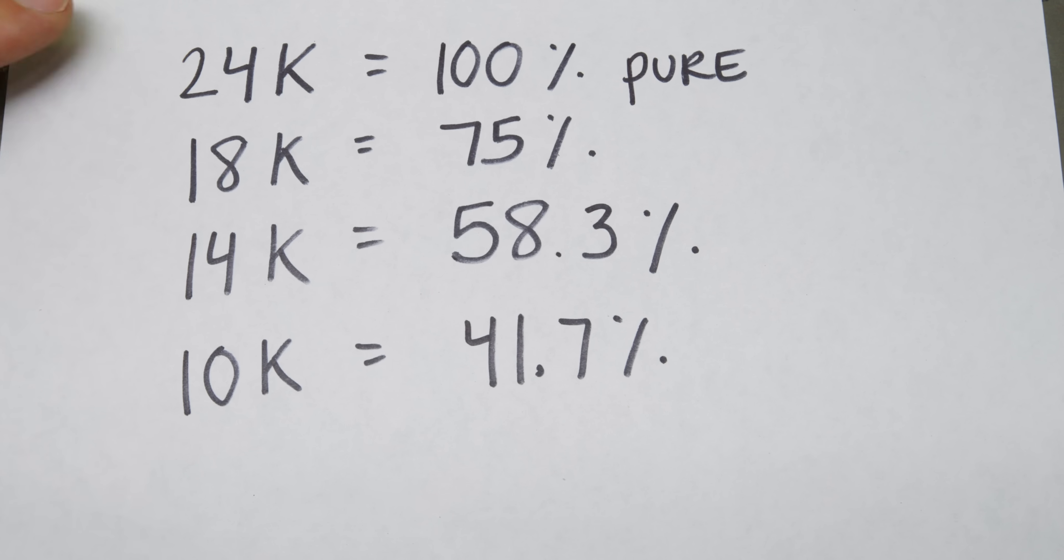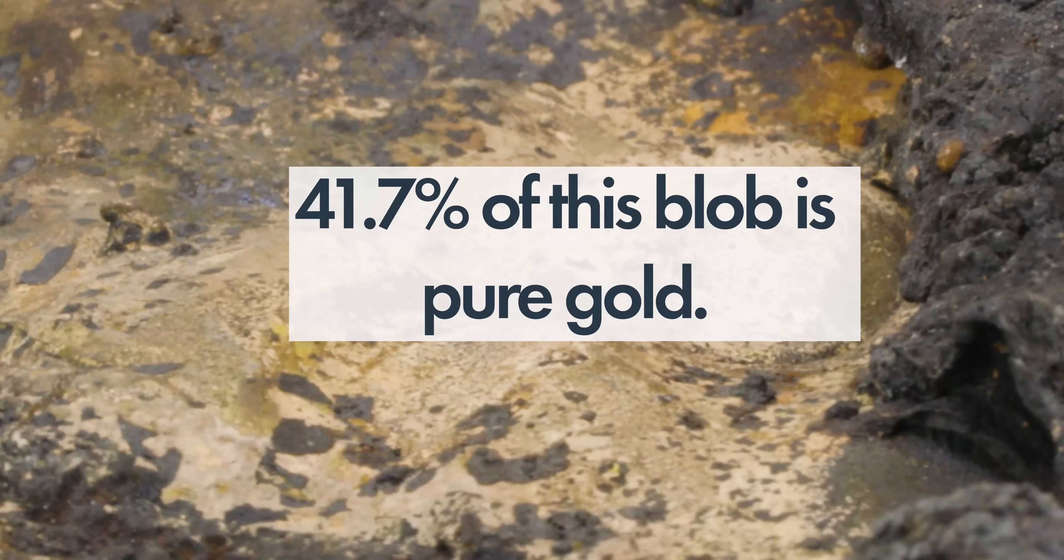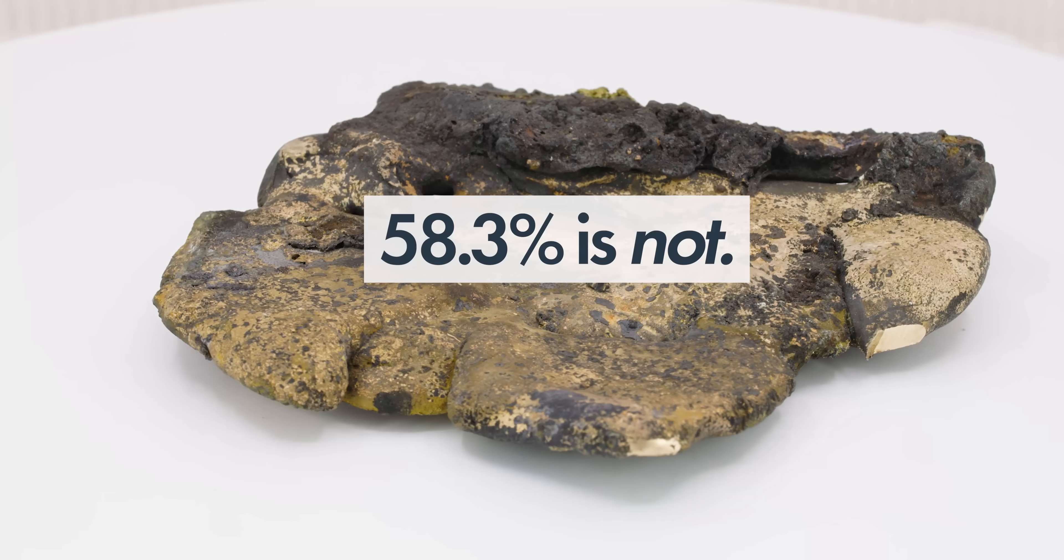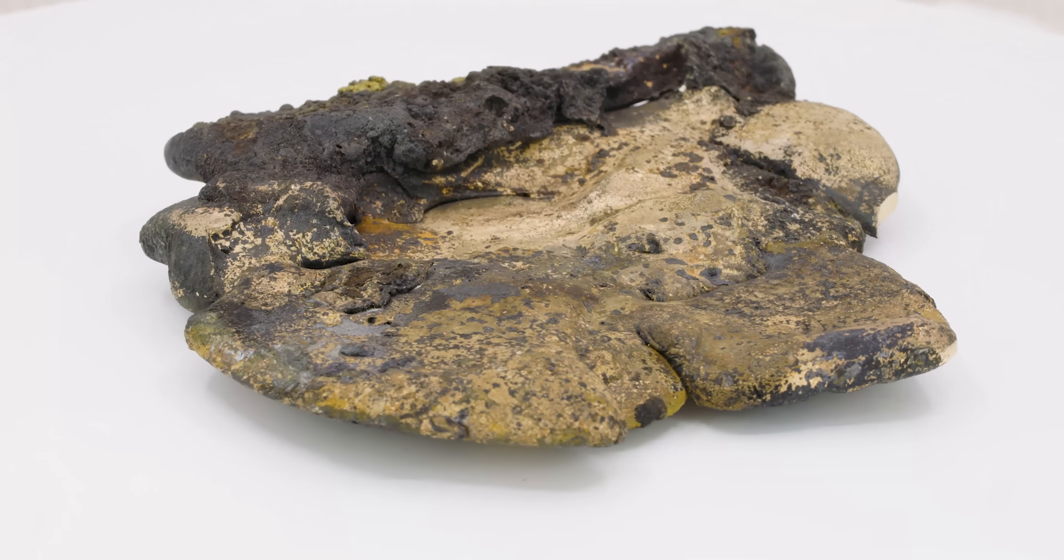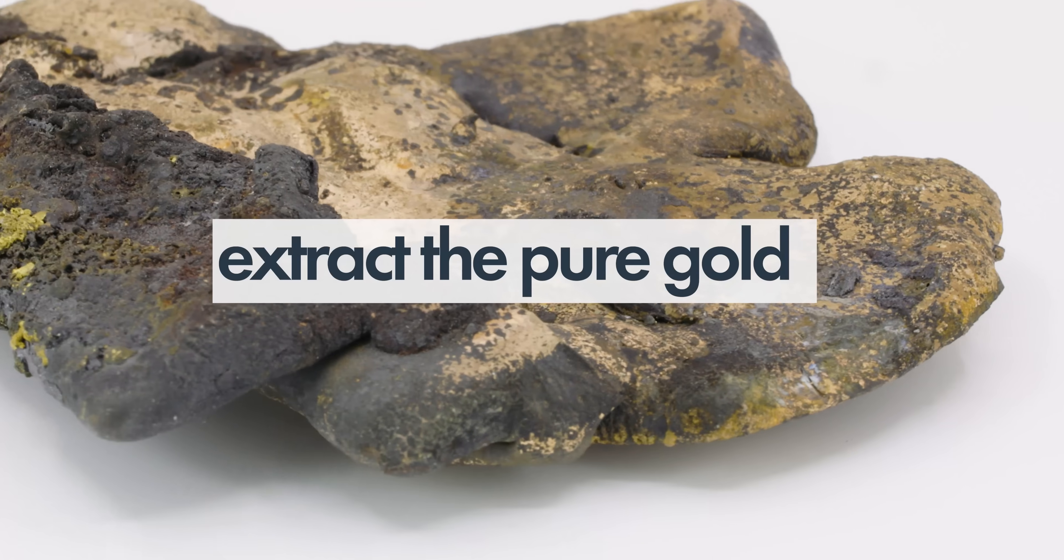10 carat gold is 41.7% pure. In other words, 41.7% of this blob is pure gold, which means 58.3% is not. It's other metals and who knows what else. The mission? Extract the pure gold using chemistry.